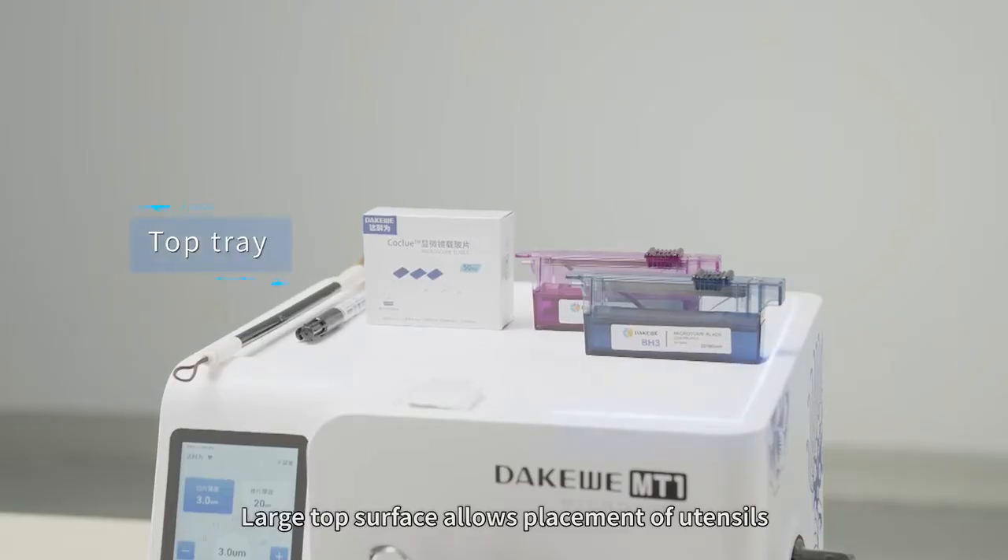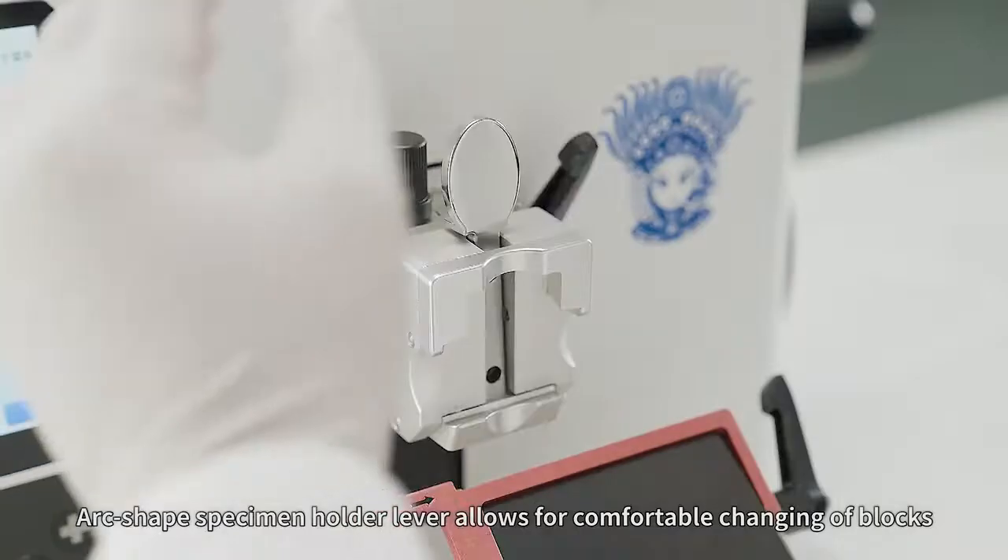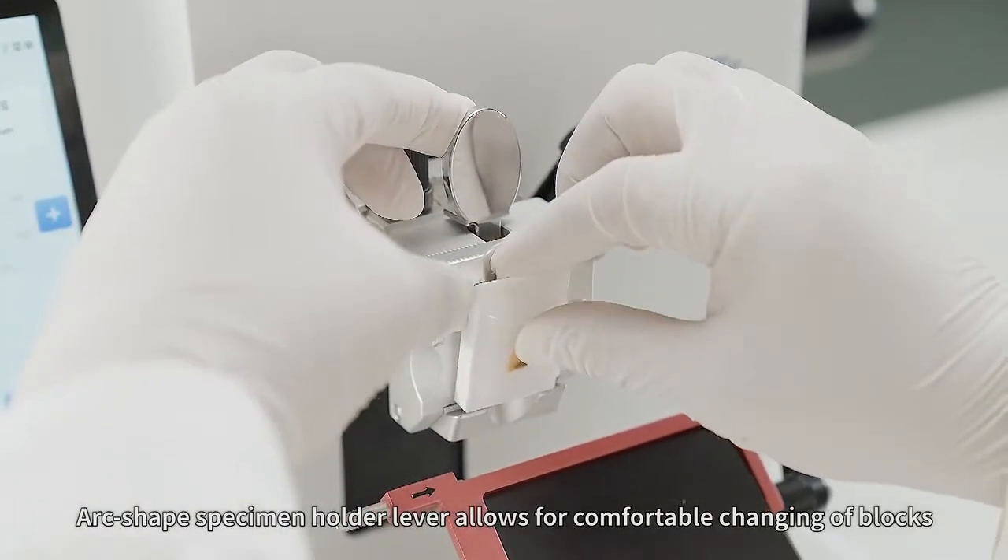The large top surface allows placement of utensils. The arc-shaped specimen holder lever allows for comfortable changing of blocks.